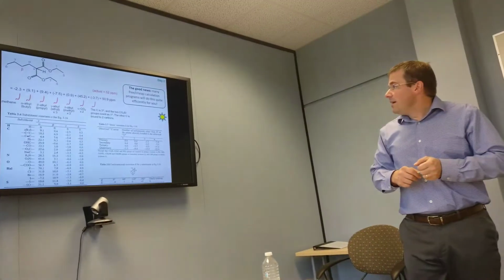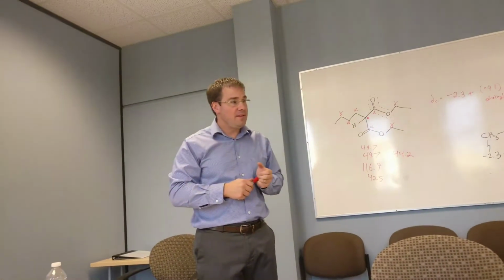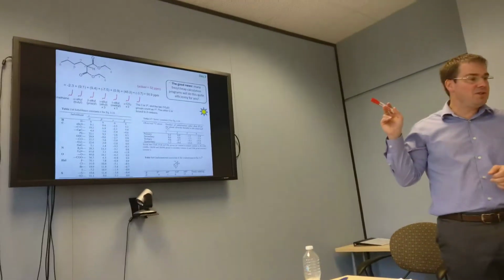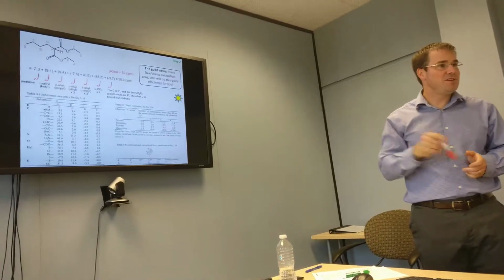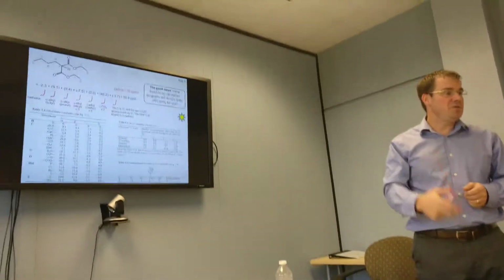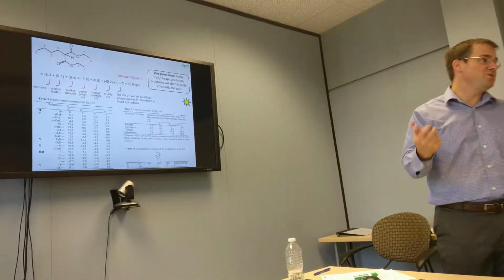Okay, good. Questions about that? Okay. So, on your assignment, I've asked you to calculate 2 carbon shifts, one for each of the molecules that I've given you, and then you'll be able to look up the authentic spectra for those as well and see how close you are or far away.